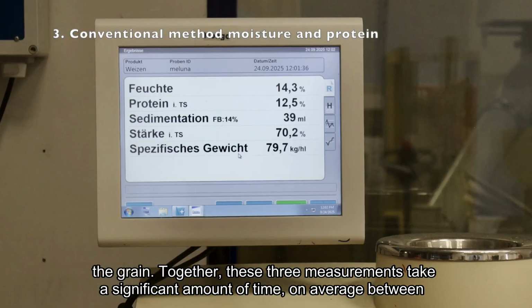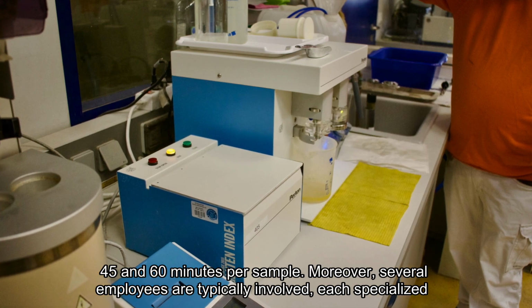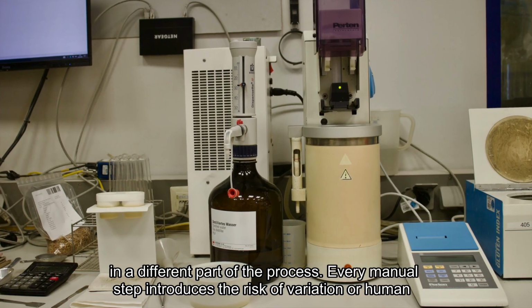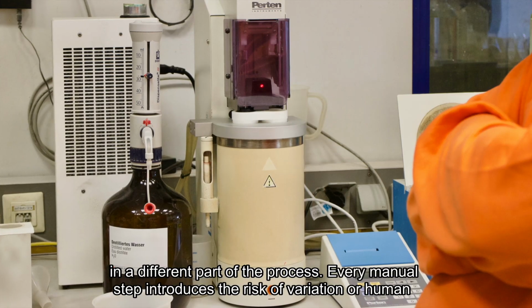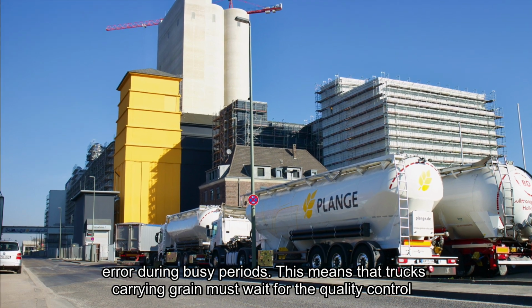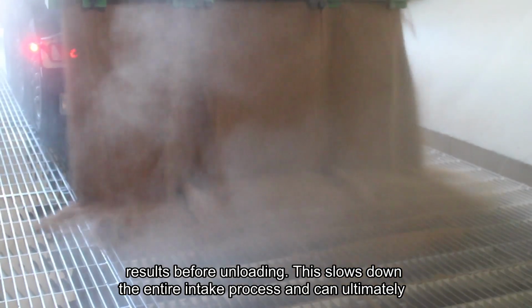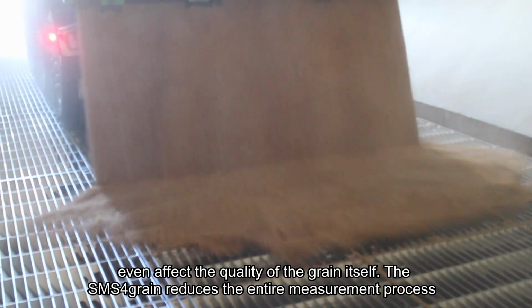Together, these three measurements take a significant amount of time, on average between 45 and 60 minutes per sample. Moreover, several employees are typically involved, each specialized in a different part of the process. Every manual step introduces the risk of variation or human error. During busy periods, this means that trucks carrying grain must wait for the quality control results before unloading. This slows down the entire intake process and can ultimately even affect the quality of the grain itself.